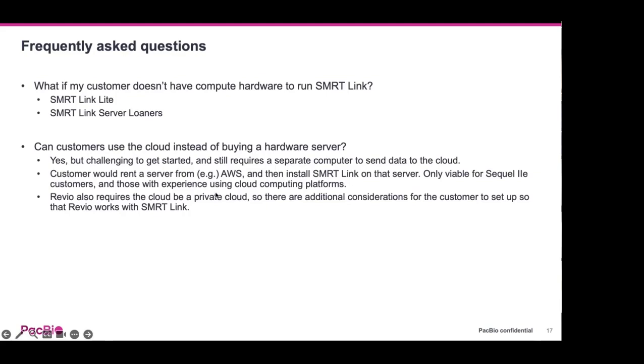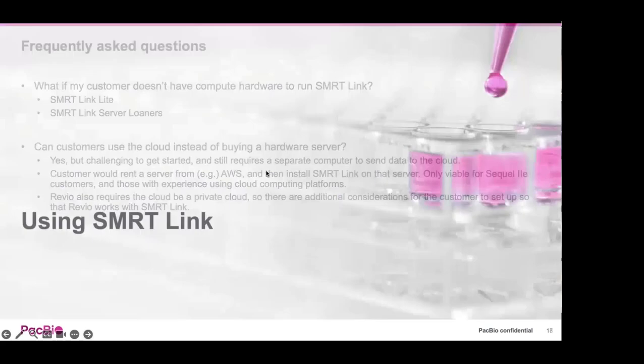I will say, I think this is not public information to customers, but we've already messaged this internally at the sales meeting earlier this year: we are working on a cloud version of SmartLink. It hasn't been announced yet. Once we have that available, it should significantly reduce all these requirements on the customer. They won't have to buy hardware anymore to connect it. They'll just need an active internet connection with their instruments. But that, like I said, has not been announced yet. So let's keep that internal for now until the official announcement later this year.